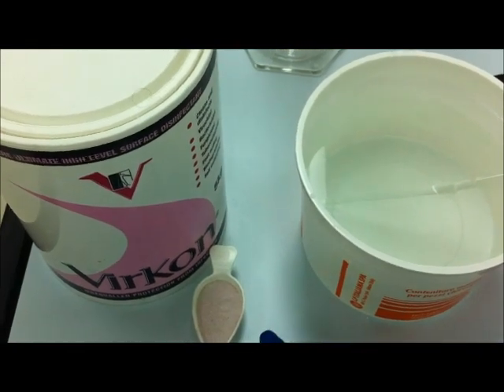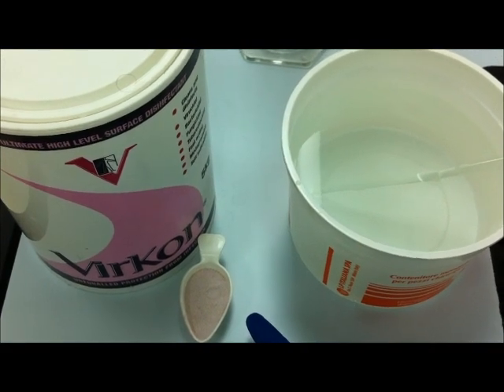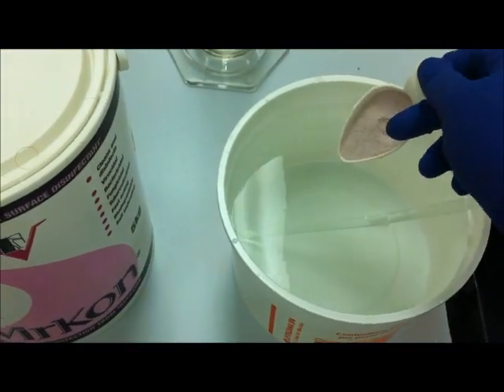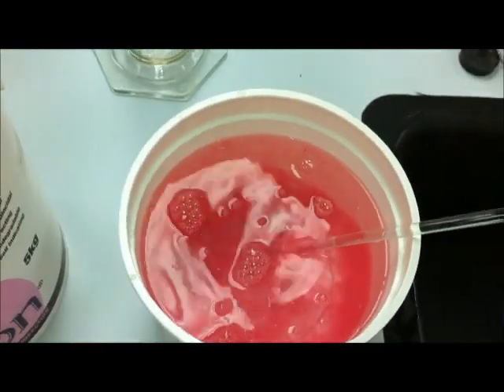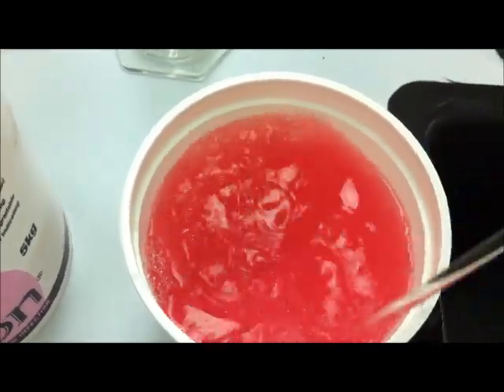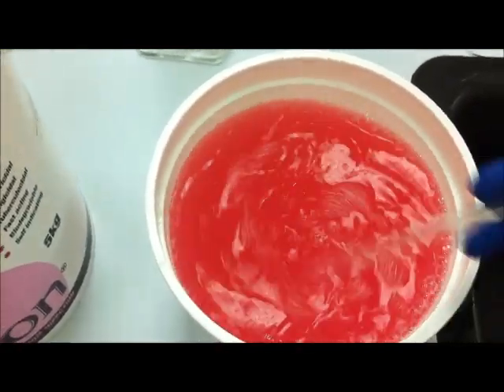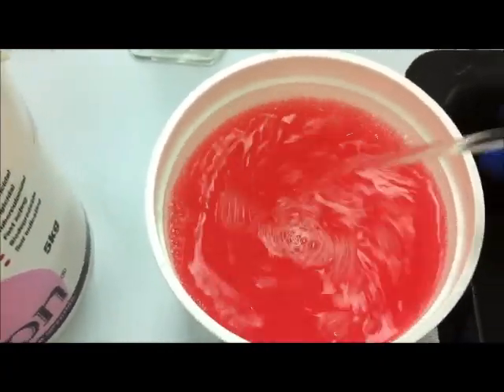The vercon we use comes in a powder form. We use about 30 grams per liter of water. We mix the vercon and pour it in the water. It instantly turns the water into a pink color. You can see the particles of vercon dissolving, giving us a bright pink color. This pink color will determine the freshness of the vercon.